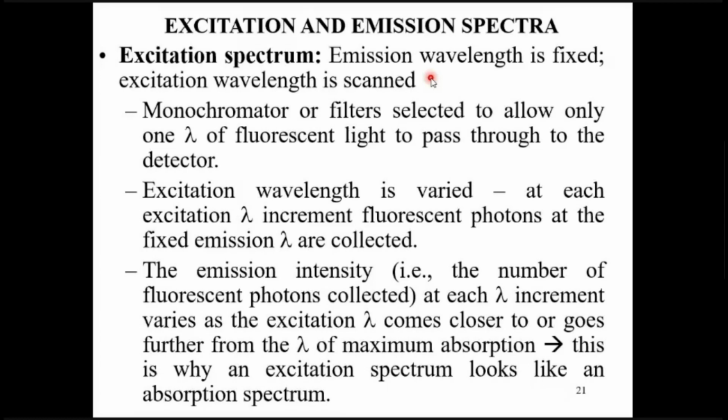Okay, the deviation is over now. There were two aspects of it, one related to concentration and one related to the intensity of the incident electromagnetic radiation. Okay, so there will always be two parts to the spectra of molecules showing fluorescence. One will be the absorption spectra, which is also called the excitation spectra, and the other will be the emission spectra. See, for any molecule, if you consider just the absorbance in the UV spectroscopy region, it was not that only one wavelength is absorbed by the molecule. The molecule absorbs a set of wavelengths, a band of spectra.